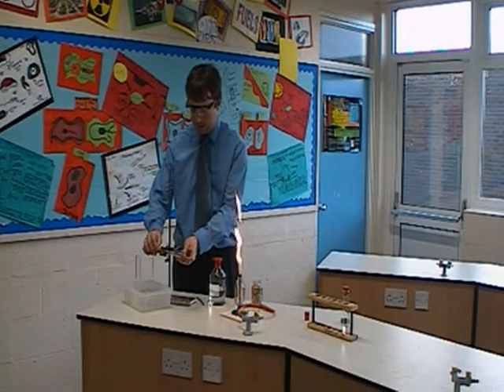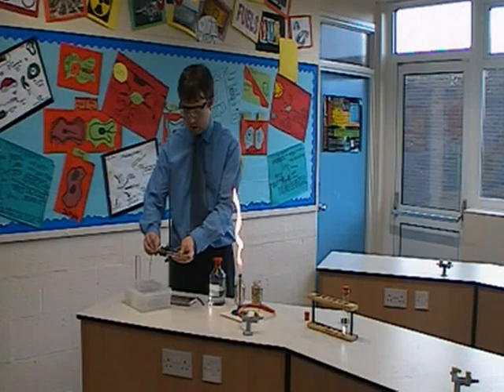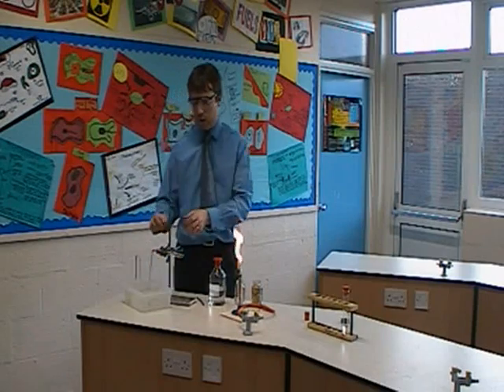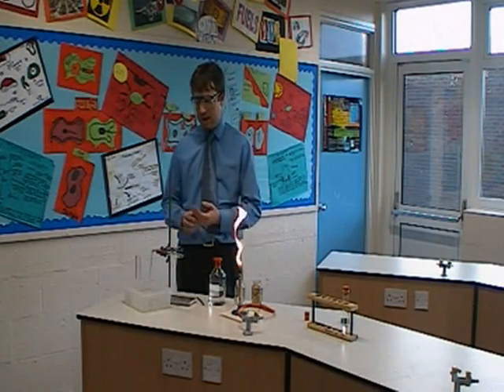I've set up the clamp stand at the right height previously to start the experiment, so that it fits quite nicely into a beehive that we've got in a trough of water, which we're going to use to collect the gas.